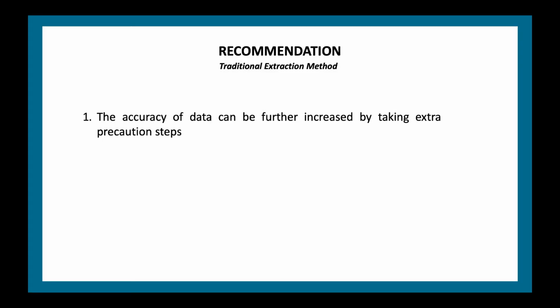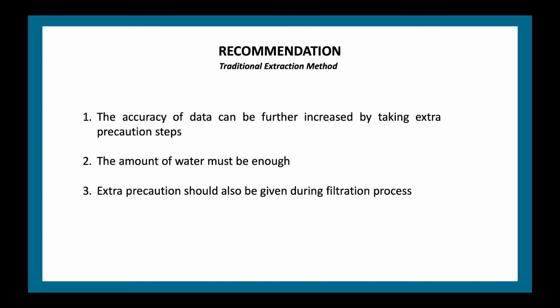The experiment can be improved by the following recommendations. Firstly, the accuracy of data can be further increased by taking extra precaution steps. Secondly, the amount of water must be enough to fully immerse the coconut kernel so that more oil can be extracted. Lastly, extra precaution should also be given during the filtration process to ensure minimum hexane oil mixture loss due to spillage of the mixture from the container.